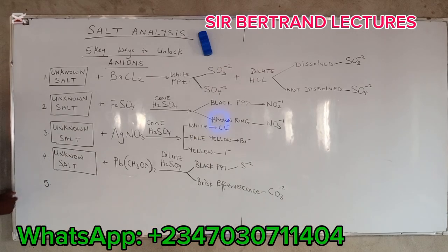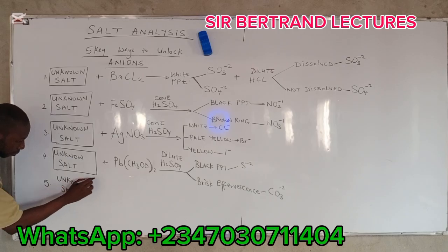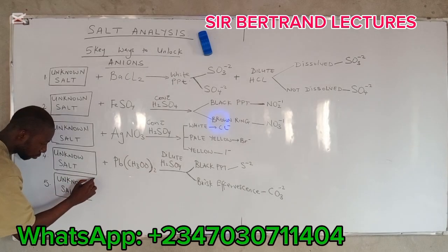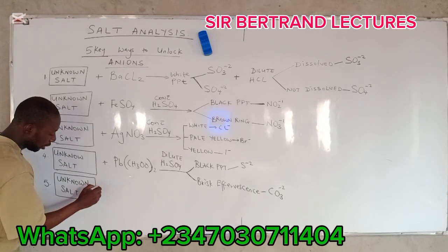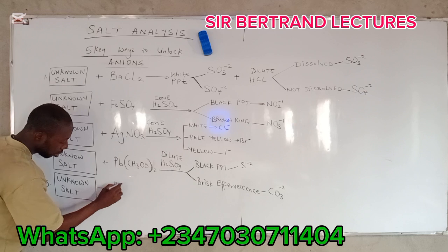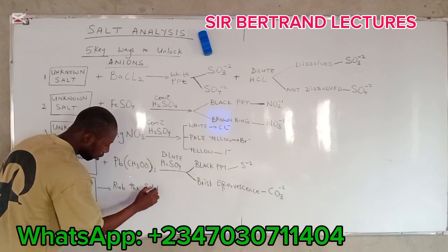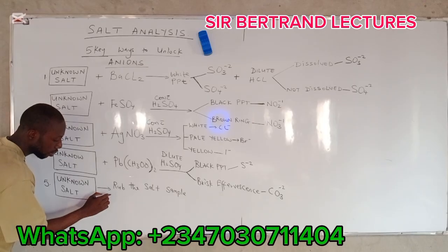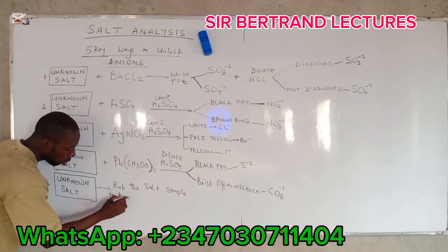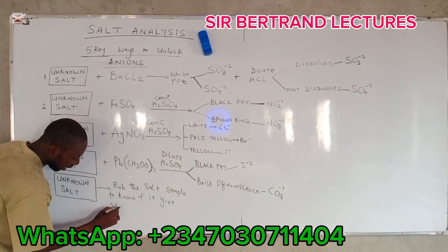Then the last key used to unlock the unknown salt sample is by smell. You rub the salt sample, all right, to know if it gives a vinegar smell.